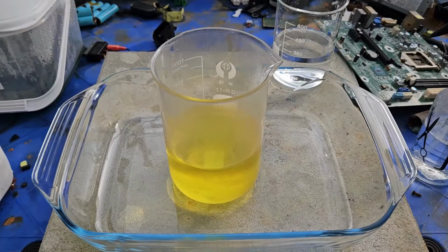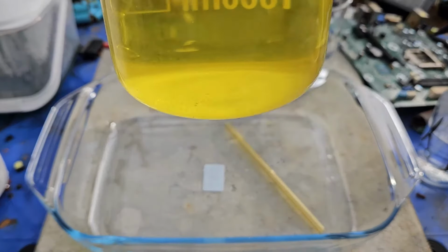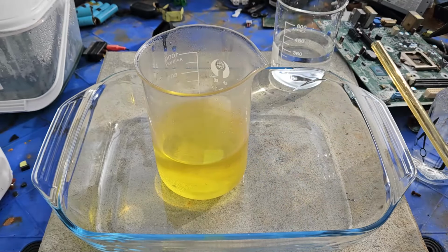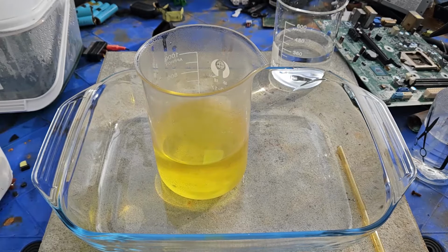Okay guys, so here we are outside, and as you can see, I'll just leave that there for stirring in a second. The solution is fairly clear after filtering. I've put it into a catch jar in case we get a little bit of overspill, which can happen, and we'll just leave that aside for a second, and we're just going to add the SMB to it, and we'll see what sort of reaction we get.